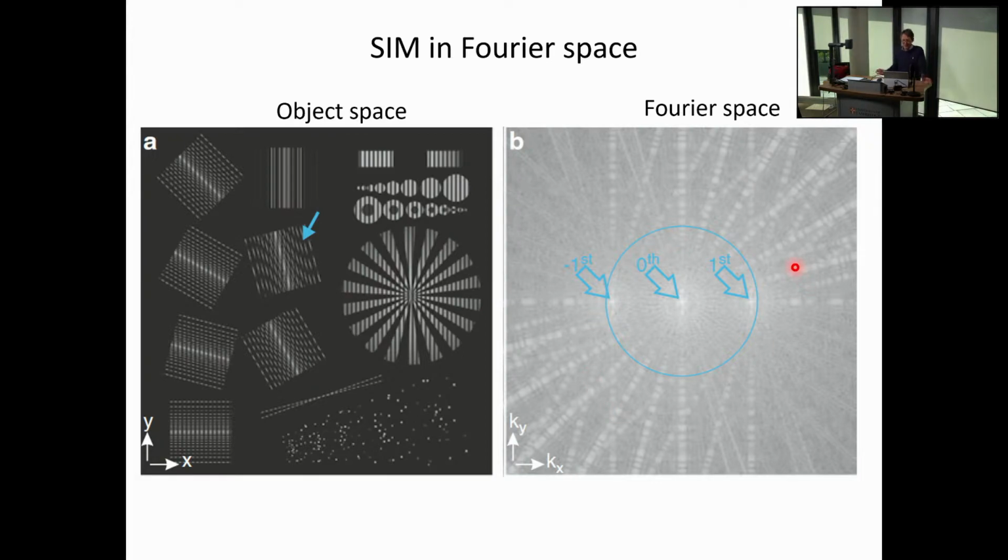I mean, you can see that this is messy, right? But you can also see that some of the high frequency stuff has now shifted into the passband. Or you see that high frequency stuff from this side has also been shifted into this passband. But the frequencies are all over the place now, right? So we need to tease them out.